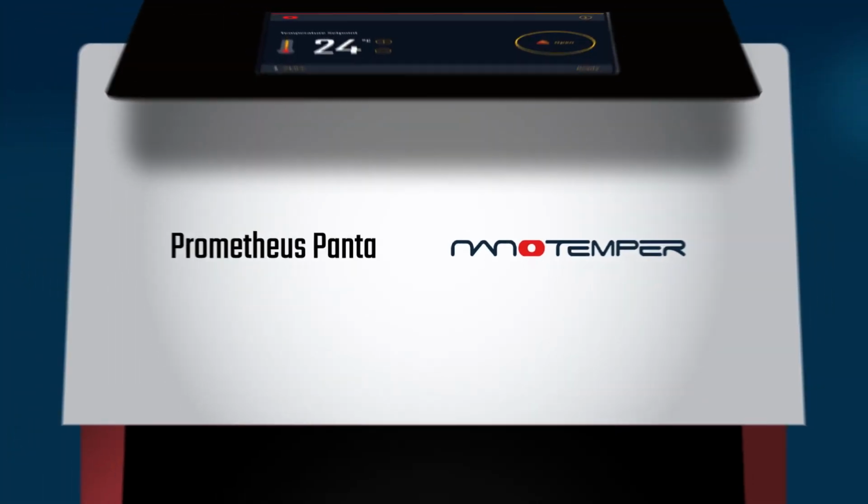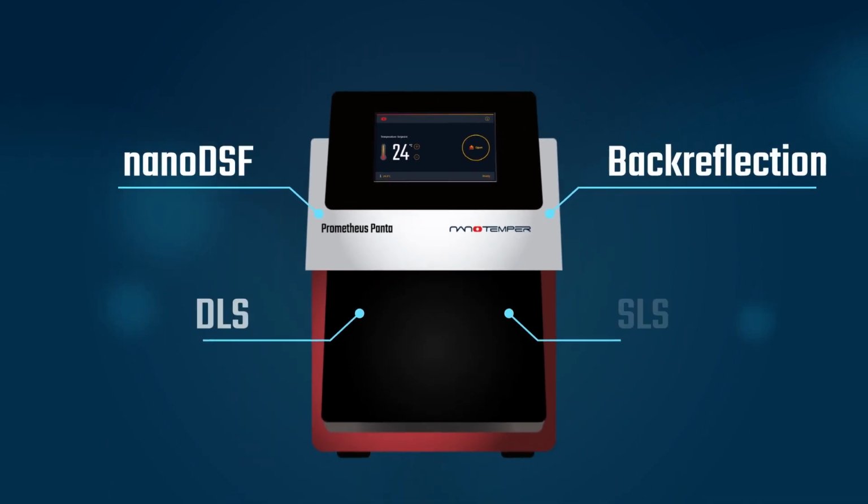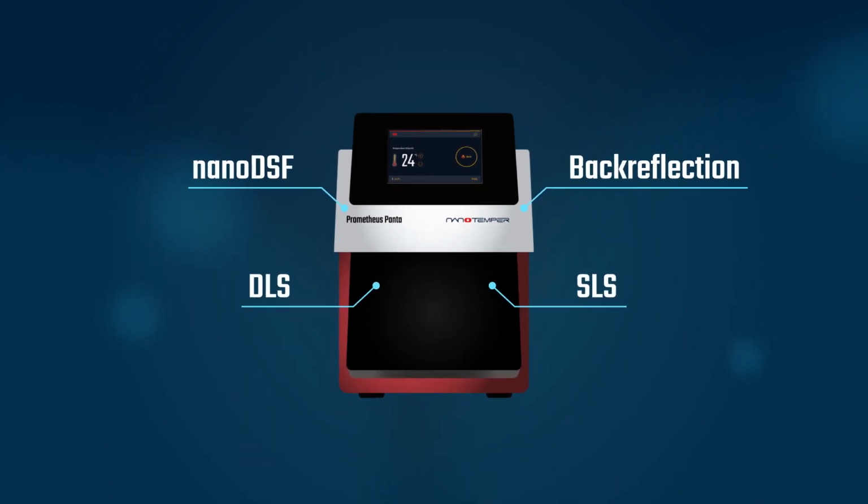The Prometheus Panta combines these technologies to give you a full stability profile of your biologic candidates. Make better, more efficient decisions about your biologics with high-quality sizing and stability data from Prometheus Panta.